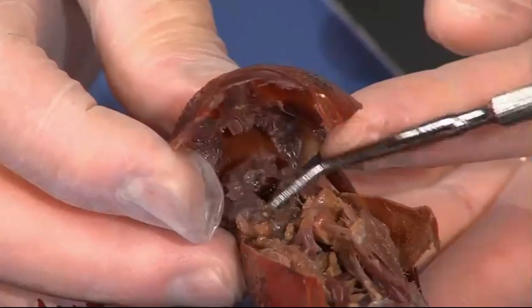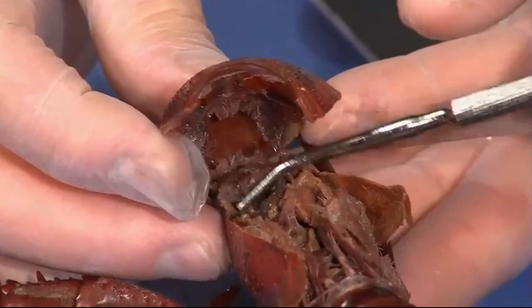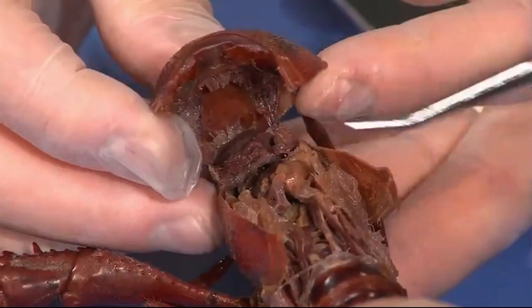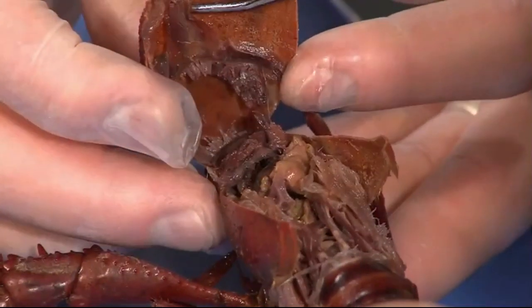That one tore open. I think this is one of those where of ten specimens, you might have one or two that are perfect. You don't want to get too carried away with it. As you lift that up — is the heart on this one up on top?